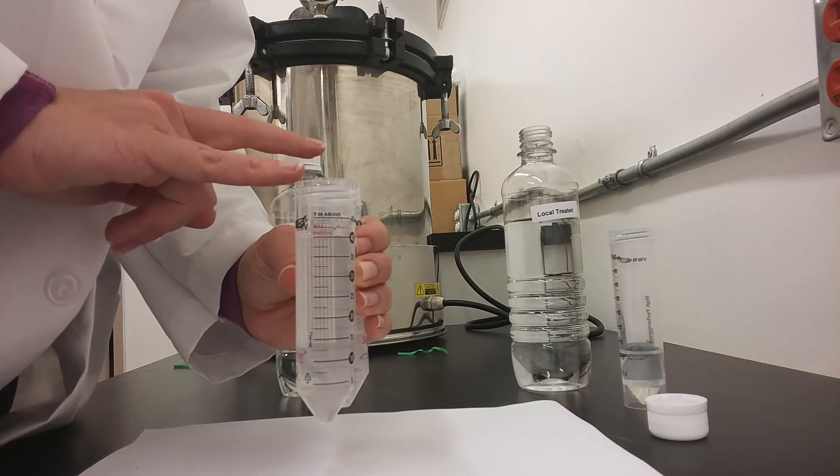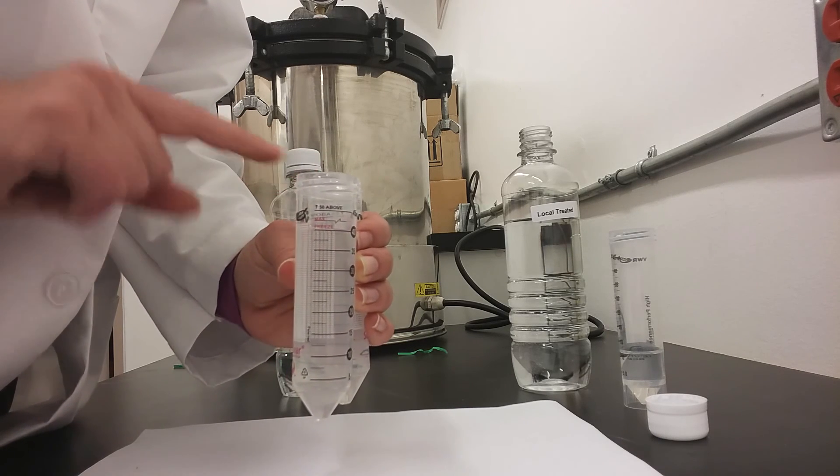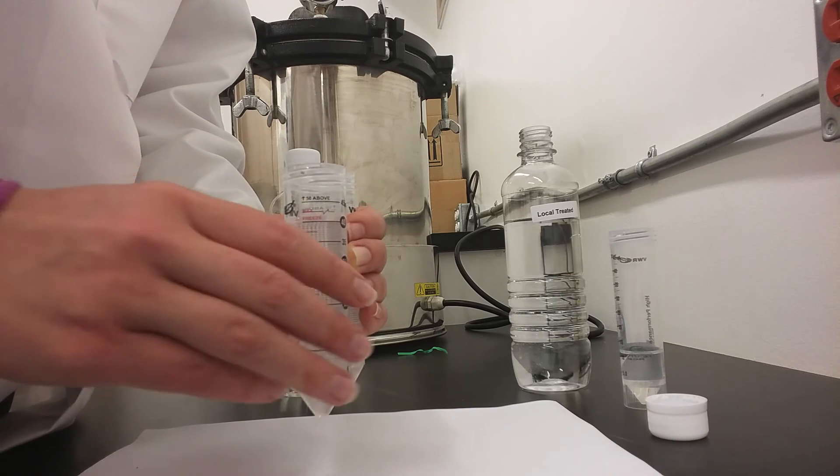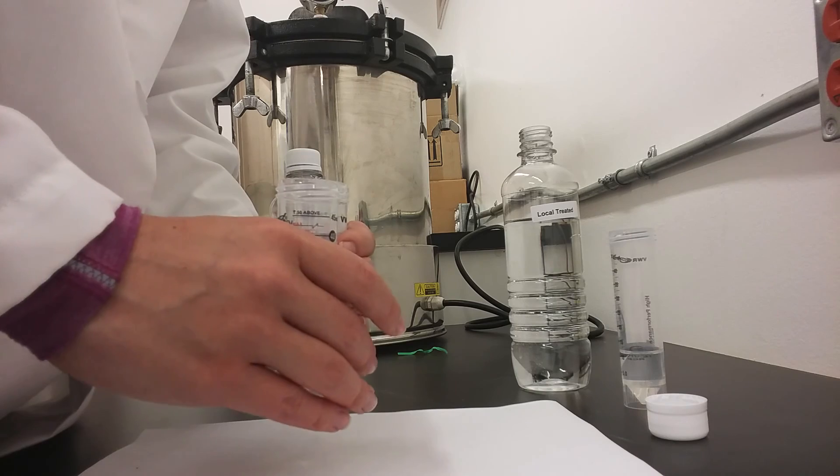The deionized water and the Control Guideline Canada sample should look similar, and your source water that you are choosing to test may look either lighter or darker depending on the quality.